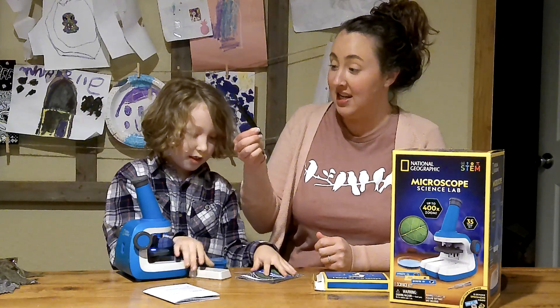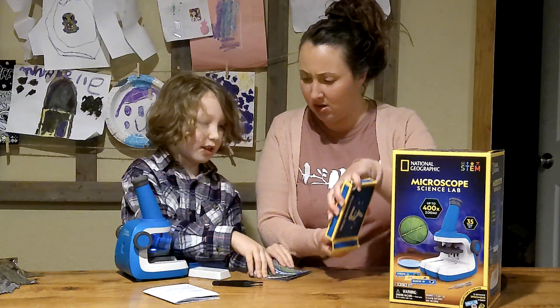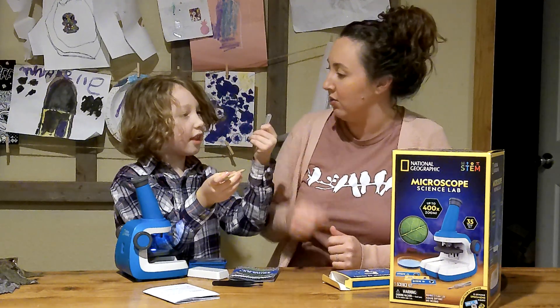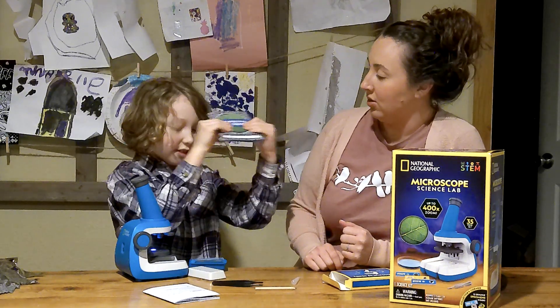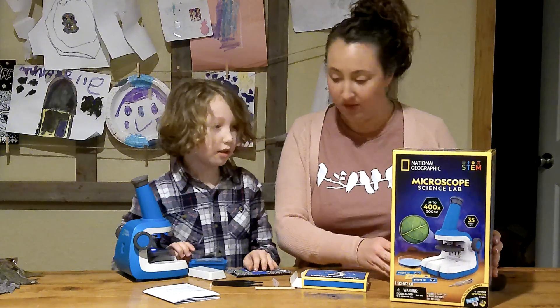So you have this handy tweezers for samples, and it also came with this tool, where if you wanted to do your yogurt like you were talking about, that would be good. And this pencil to write in your journal, where you can write your observations.